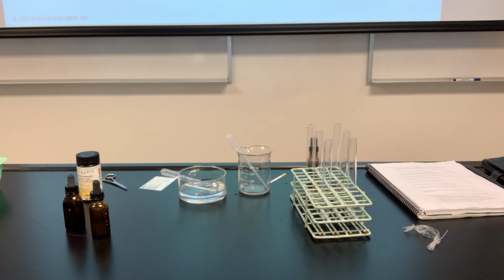Now, here's what you want to do now. Listen to the directions for cleanup because we got about 10 minutes to do that. Listen carefully, please. Everybody listen, please, so we can get it done. The slide that has the plant cell on it. Listen to me and watch me over here, please. The slide that has the plant cell on it, you're going to hold and you're going to go like this to release the slide, the cover slip, and the plant in here. The actual slide, you're going to rinse and put standing up on the rack. That's the slide for that.